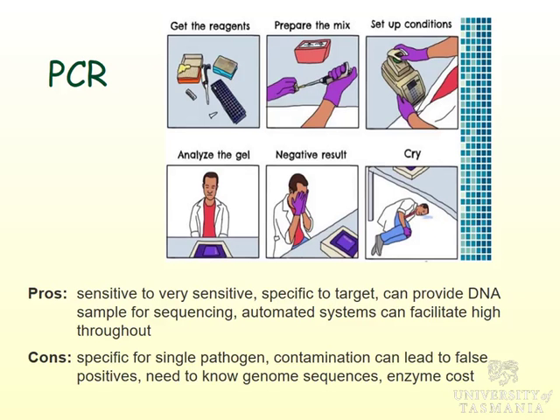When PCR was first set up, I remember hearing, at least from some labs, they were doing work on, I think it was Y chromosome stuff, and they refused to employ males because they were contaminating all their samples all the time, just by handling it, even while wearing gloves and things. I think procedures are a lot better now, so you don't need to do that sort of stuff. But the potential for contamination is such that some people get quite paranoid.